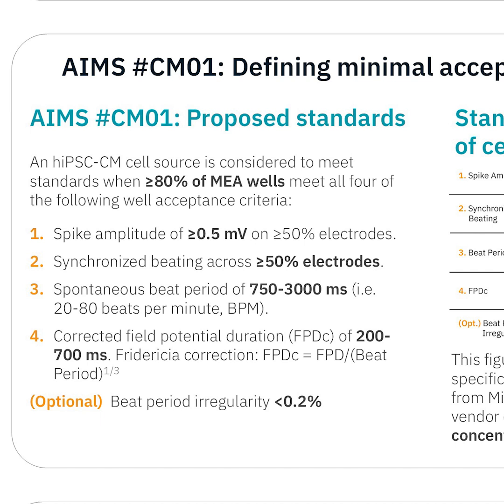See Figure 5. For the top end of this range, working with iPSC cardiomyocytes with spontaneous beat periods greater than 3000 milliseconds can be impractical due to the longer recording periods required to capture sufficient beating events for analysis of these datasets. It is worth noting here that primary ventricular cardiomyocytes should not spontaneously beat, and the spontaneous beating observed in iPSC ventricular cardiomyocytes is often attributed to their immaturity.